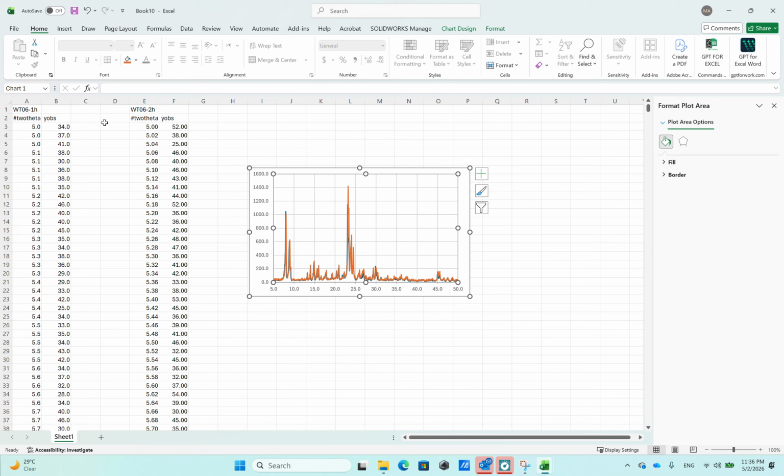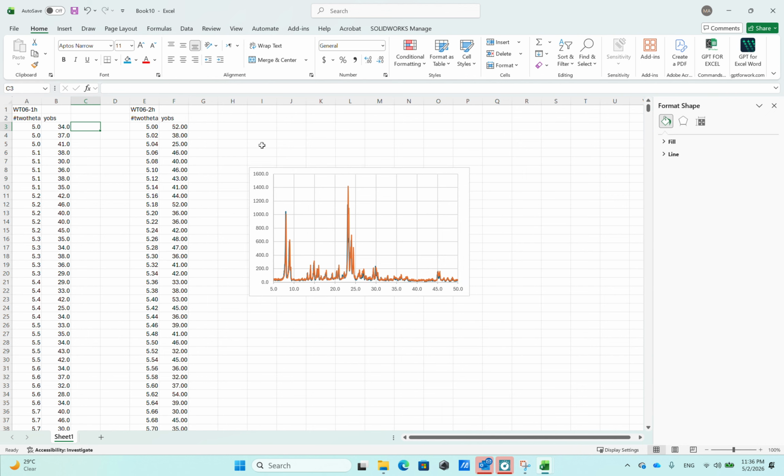You need to create a new y-axis, simply by making this equation equal to this original y-axis plus the value which is going to be written in this cell, and you need to fix that value by clicking F4 one time. Then click enter and come back to the cell.